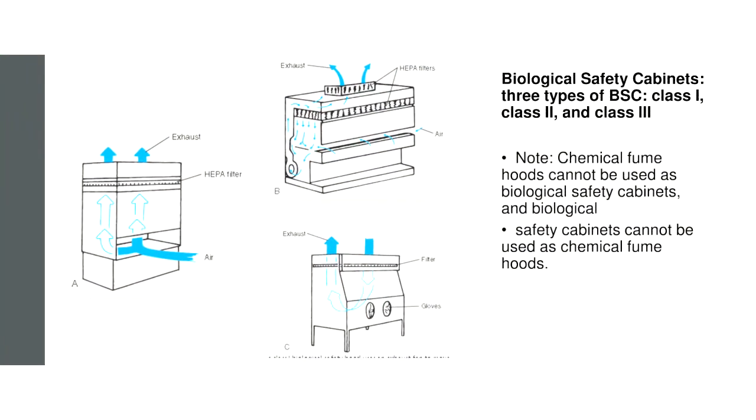Anyway, kapag class 3 biosafety cabinet, so, meron siyang butas dito. Yung butas na yan, dyan mo pinapasok yung kamay mo. So, meron na siyang built-in gloves. Okay? So, pag pinasok mo na yung specimen dyan sa loob, so, meron naman yung door, pwede naman siyang buksan. Papasok mo yung specimen. However, when you open the specimen, dapat dito sa loob ng cabinet. And then, gagawin mo, papasok mo yung kamay mo dyan, since may gloves na yan sa loob, then, pwede mo nang i-open yung specimen. Kumbaga, ito yung mga specimen na hindi mo siya pwedeng basta-basta na lang i-open.